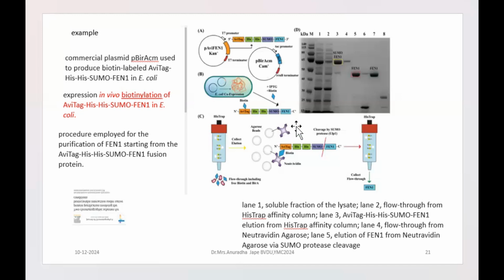So that's why, schematically, it is shown as a molecule with four facets. It is anchored onto the gel bead, and now it has specificity for biotin. Whenever all the protein samples you have extracted from this E. coli are loaded into this column and the column is allowed to run, proteins which have this biotin tag will interact with avidin and get retained on the column.